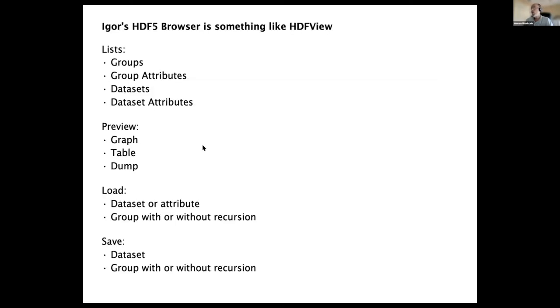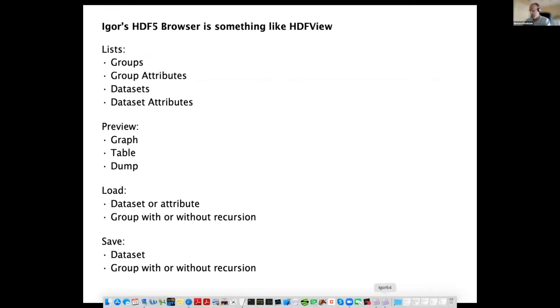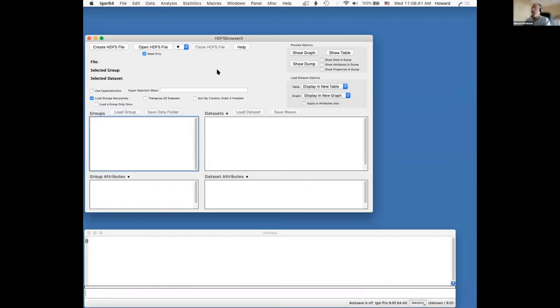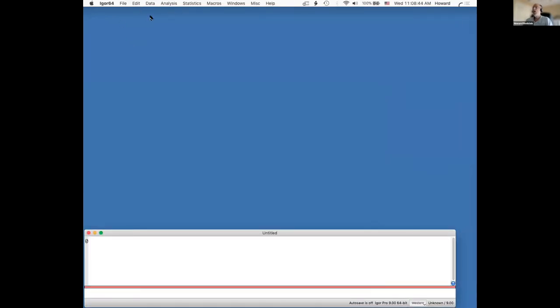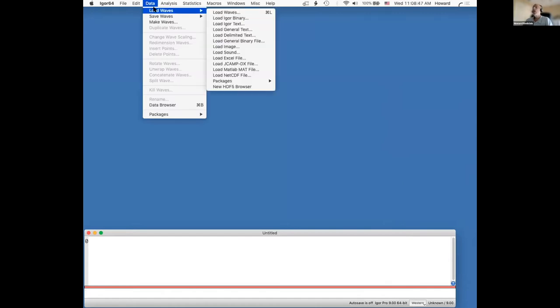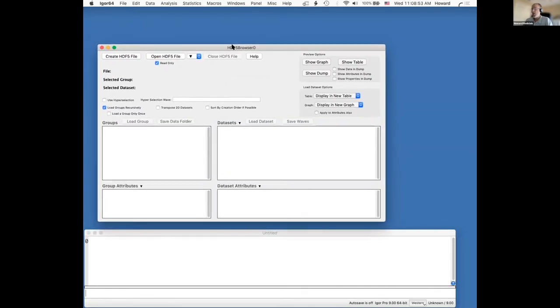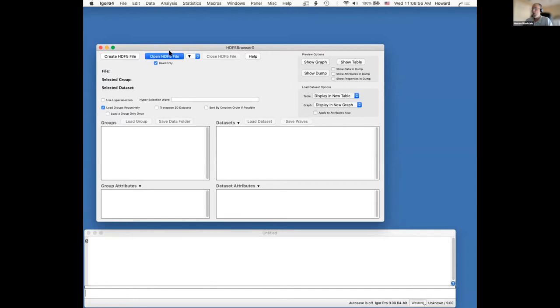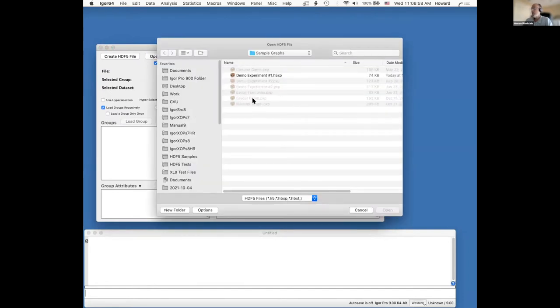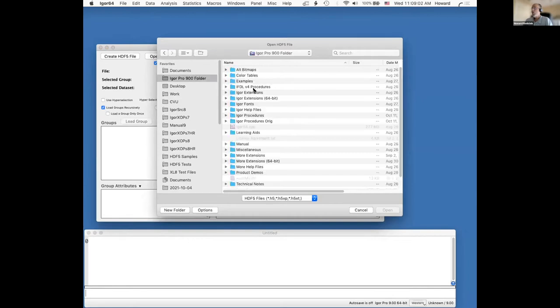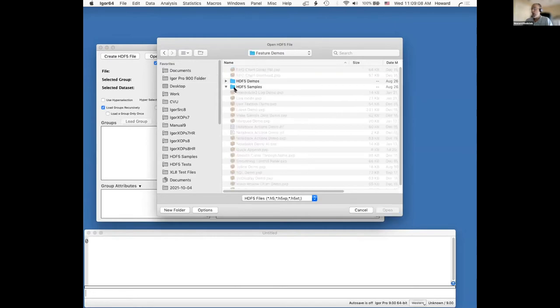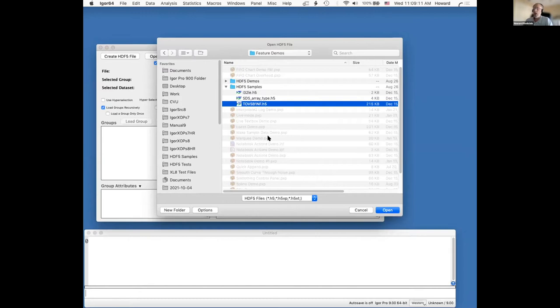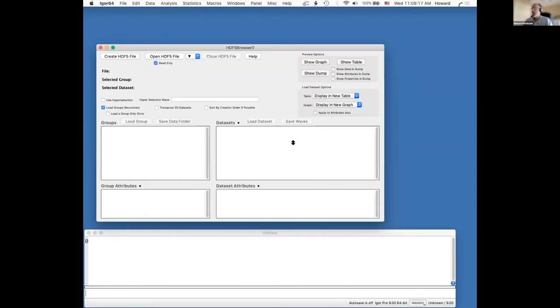I'm going to show you Igor's HDF5 browser now. To create an HDF5 browser, you go into the data menu, down to load waves, and then new HDF5 browser. Here's our HDF5 browser and I'm going to click open file. We ship a few sample HDF5 files which are used with a guided tour. This is one of them — I got it decades ago; I think it's a NASA file.